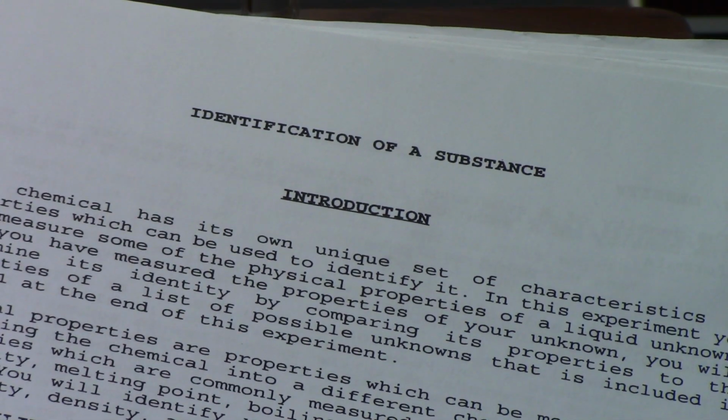Okay, so I'm going to do lab number 1. It's called identification of a substance. What we're going to do is I have an unknown, it's a pure substance, as pure as it can be, and I don't know what it is. I have a choice of the possible things it can be.